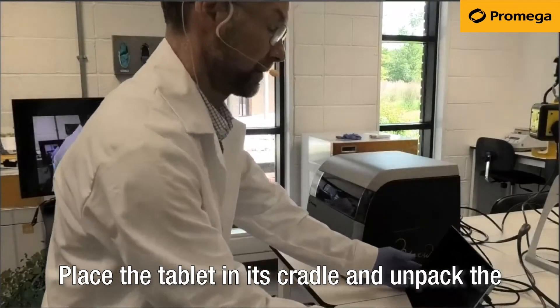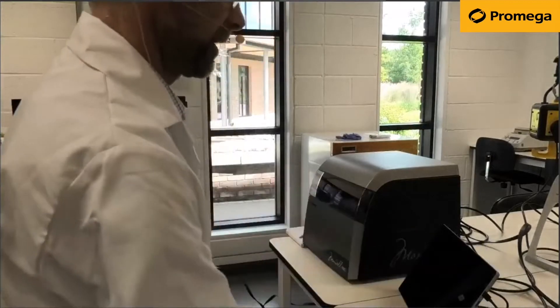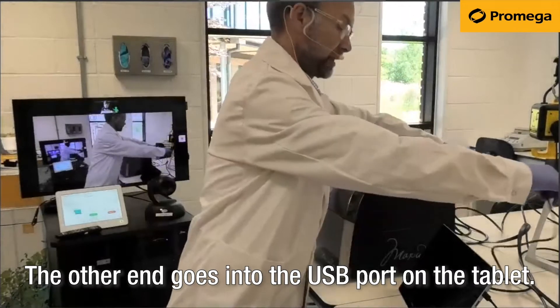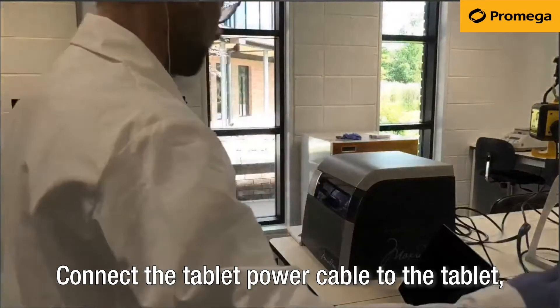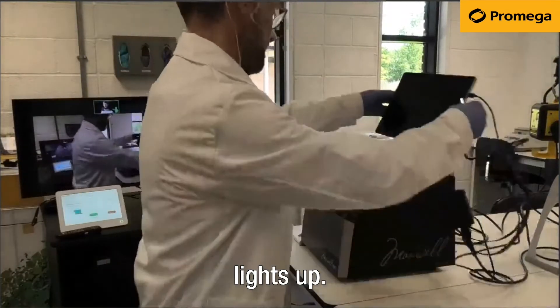Place the tablet in its cradle and unpack the power cables and USB instrument cable. Connect the USB-A end of the USB cable into the back of the Maxwell instrument. The other end goes into the USB port on the tablet. Connect the tablet power cable to the tablet, ensuring the white light on the magnetic connector lights up.